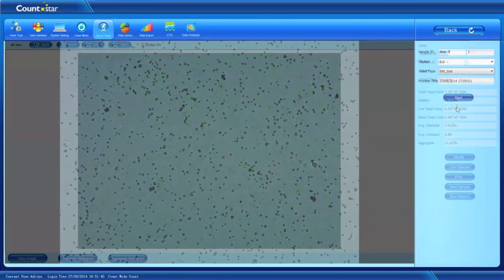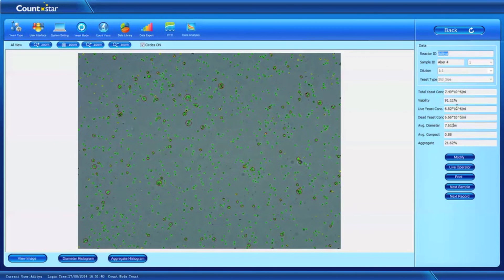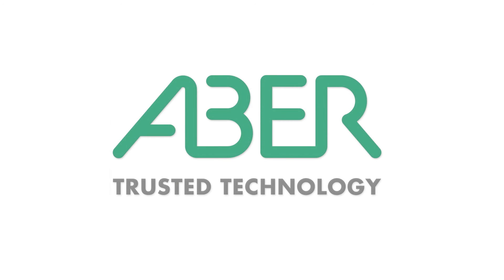The software is very easy to use. It is intuitive and automatically saves data, including images, for future reference. For more information on the setting up of the CountStar yeast, analysis of samples and extra features, please refer to the appropriate ABER training videos.